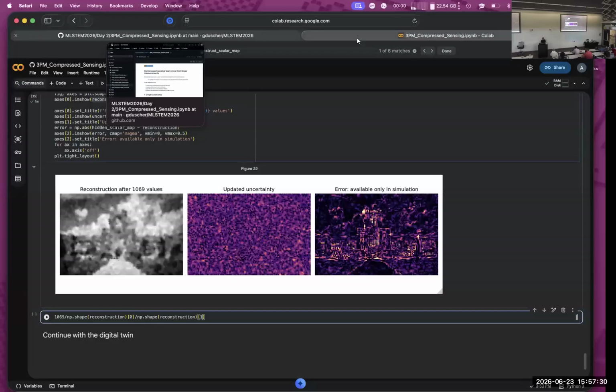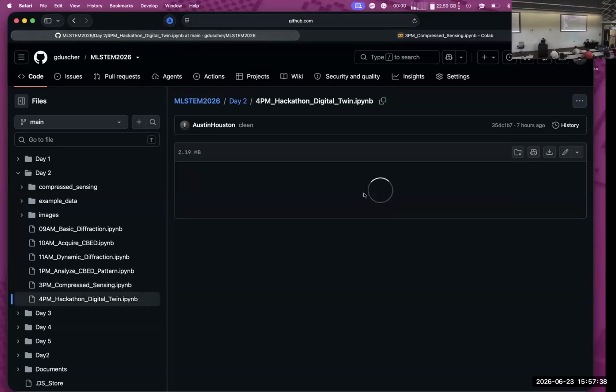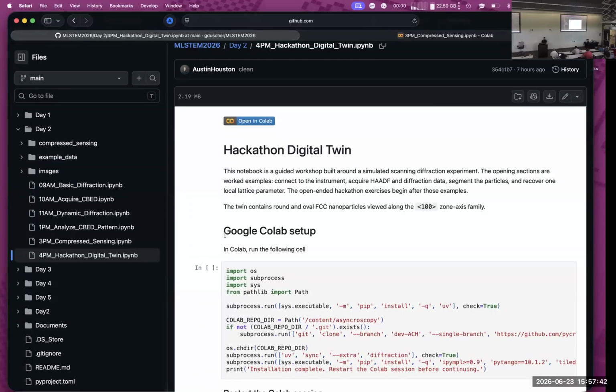Okay, so with that, let's go to the hackathon. The hackathon notebook is going to be this 4 p.m. Hackathon digital twin.